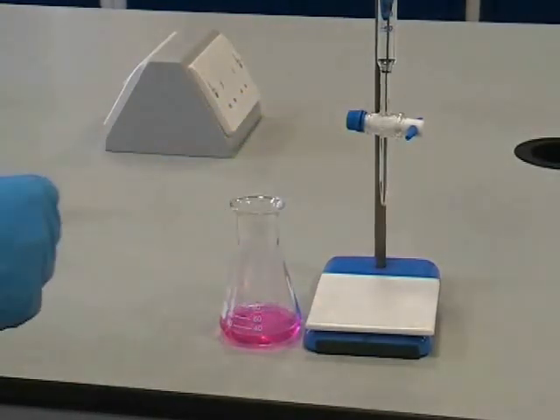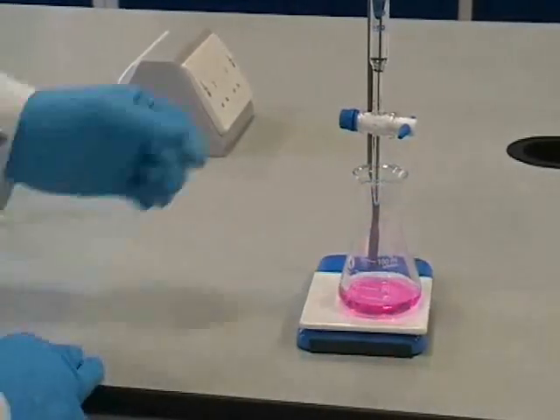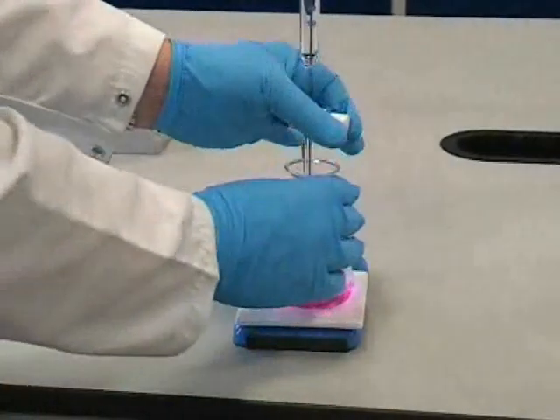Now we can carry out a rough titration, sometimes called an overshoot titration, to find out roughly how much of our other solution is needed to neutralize the solution in the conical flask.